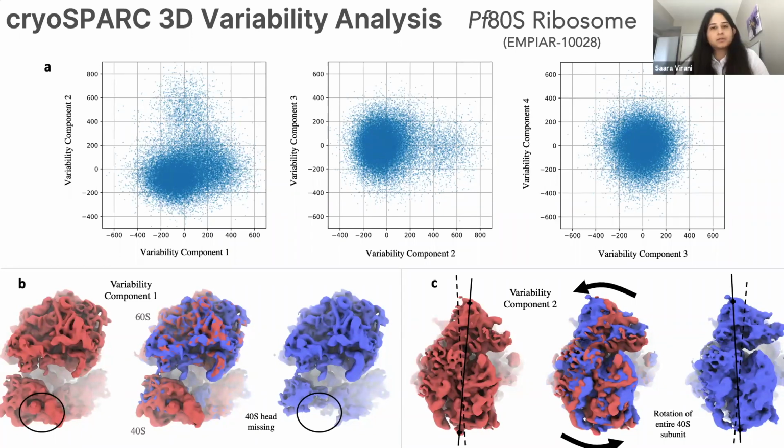Going back a little bit to what we can actually infer from the results of 3D variability analysis. You had mentioned earlier that the observations that we can make, we can't necessarily connect those with a particular underlying assumption about what's happening. So is it possible that some of the variability components come from vibrations of molecules in the ice rather than intrinsic conformational variance in the protein itself? I'm going to guess that the question is about thermal vibration or like thermal motion.